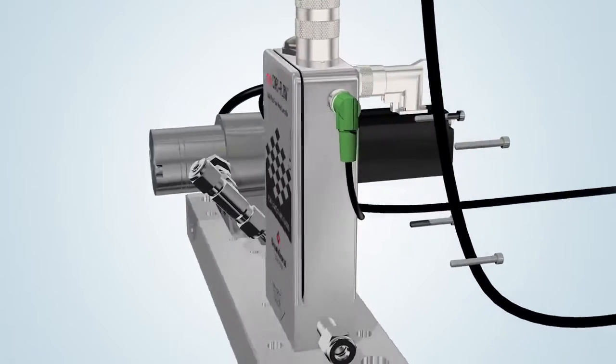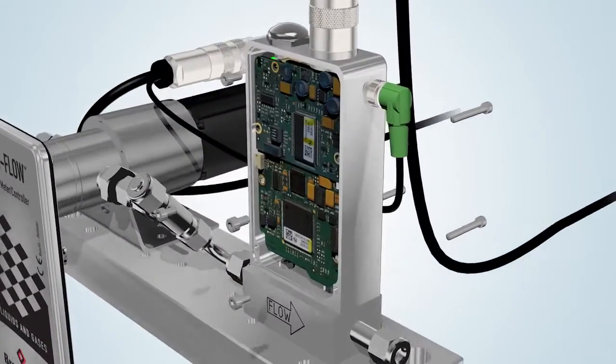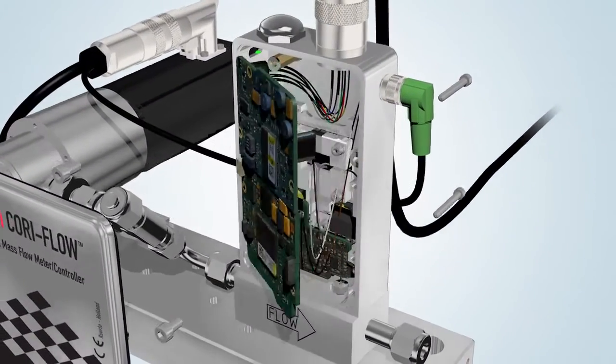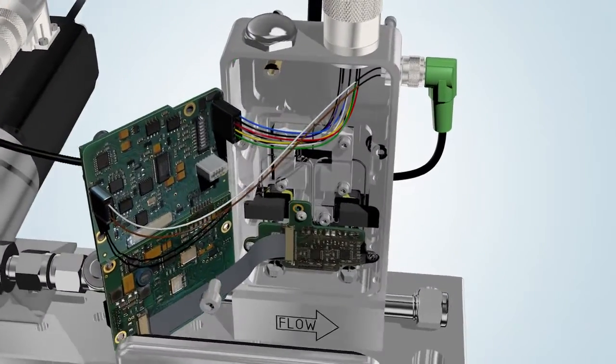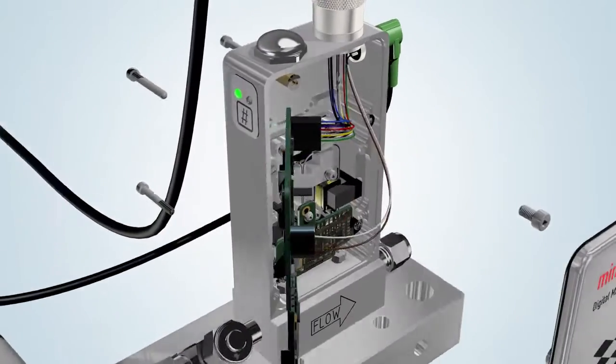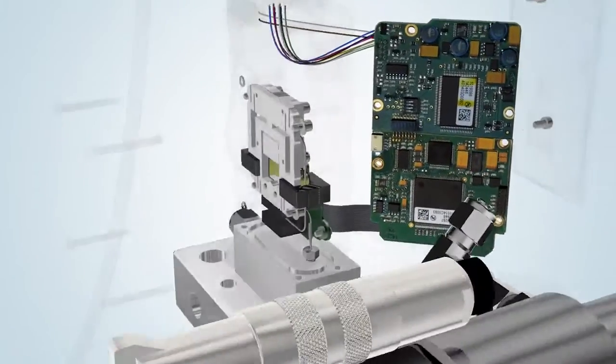Inside the robust Mini CoriFlow housing are the digital electronics, optical sensor and sensor tube. The internal diameter of the sensor ranges from 0.25 mm to 3.1 mm.